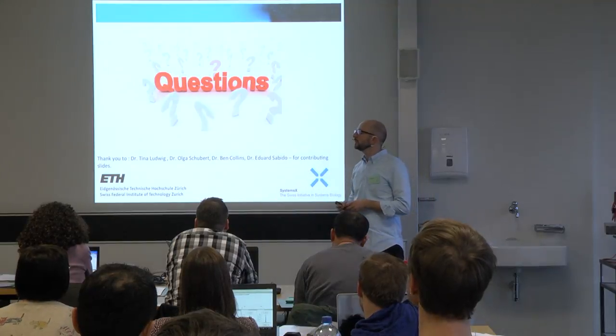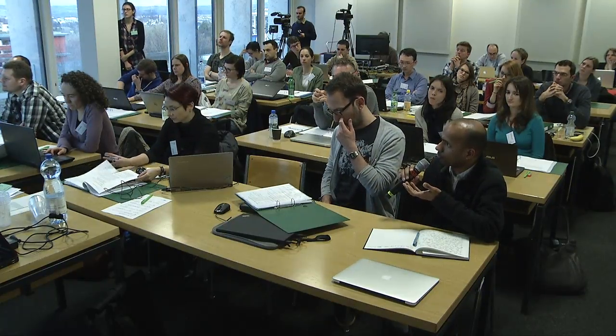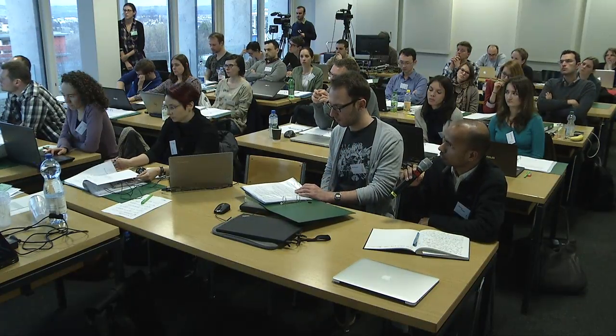If yes. Just one small question. So in your experience, how good is the Y4 ion as a transition for quantitation? I mean, I know it's small. Is it too small? I mean, it is a small fragment, but how often is it used for quantitation?